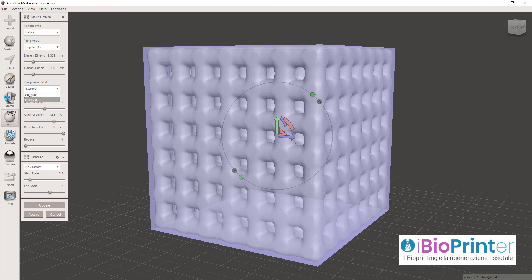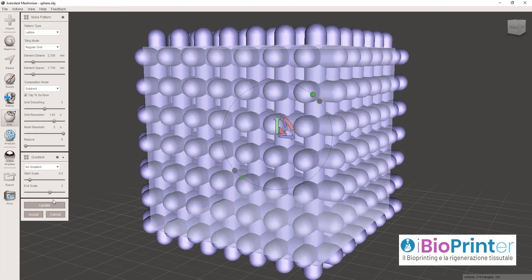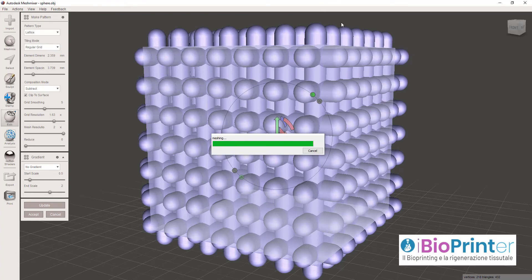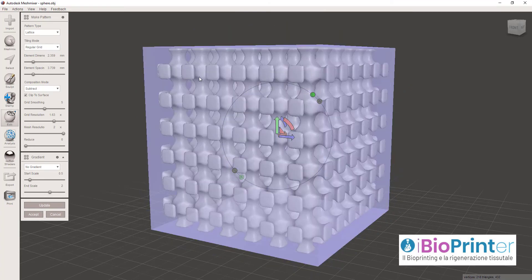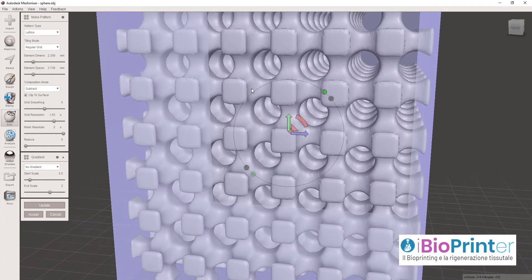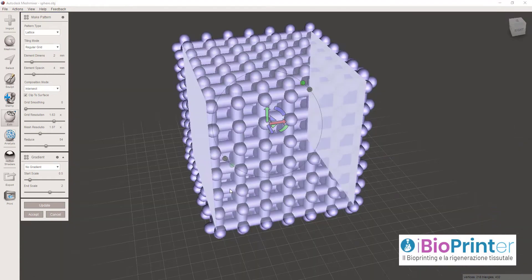Cliccando su Subtract, ripetendo la stessa operazione, vedremo la stessa struttura però positiva e decisamente molto più smussata rispetto alla precedente.